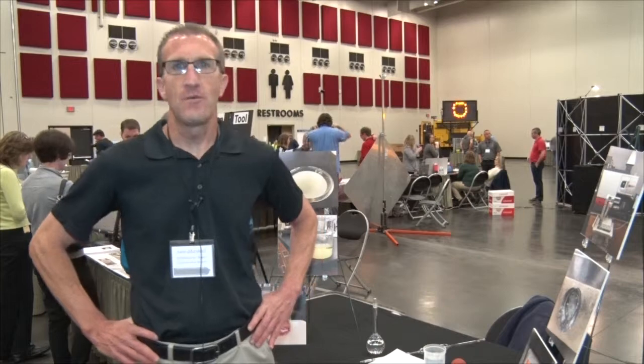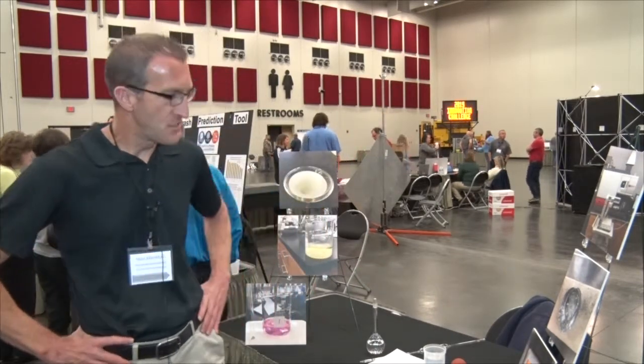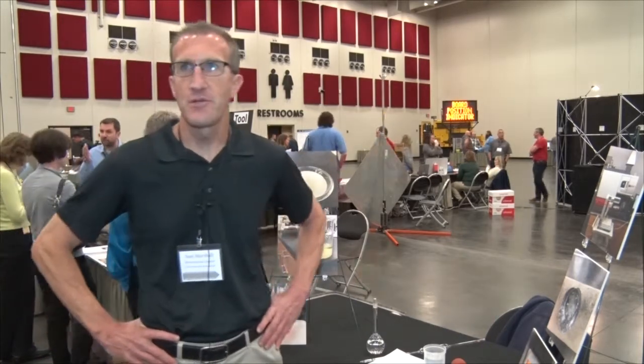My name is Sam Marshall. I work in Central Office, Chemical Laboratory, Construction Materials Division, and my innovation is determination of aluminum oxide in high friction surface treatment.